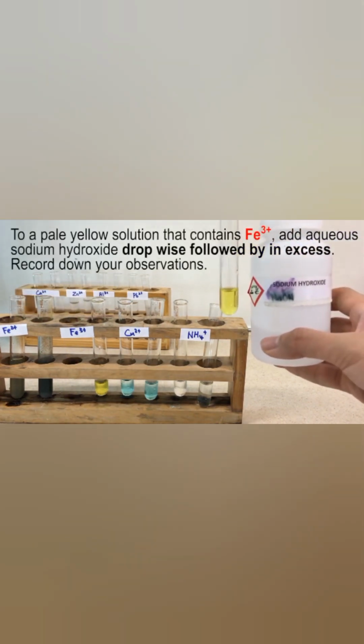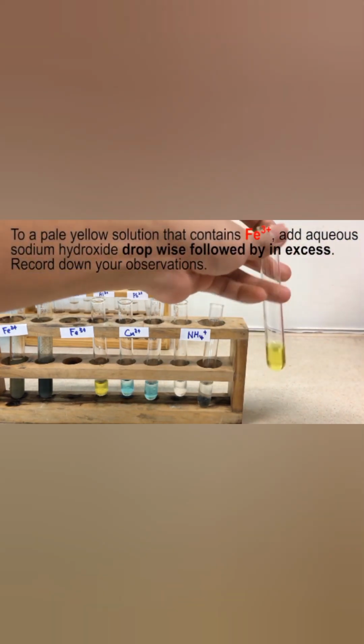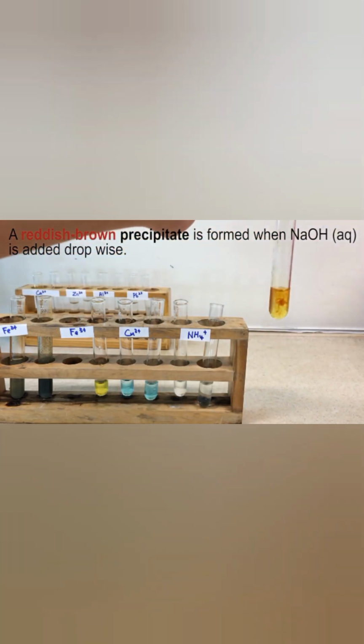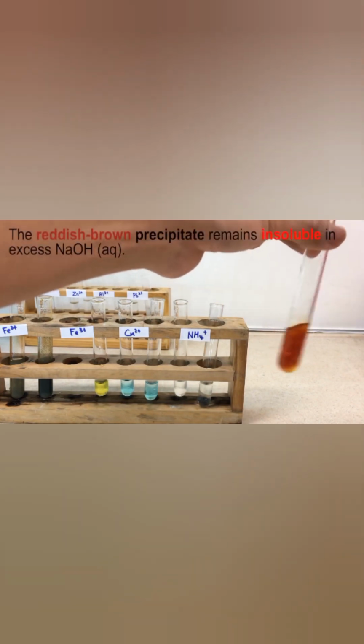Now, to a pale yellow solution that contains iron 3, add aqueous sodium hydroxide in drops. You will notice what happens there. A reddish brown precipitate is formed when aqueous sodium hydroxide is added in drops.